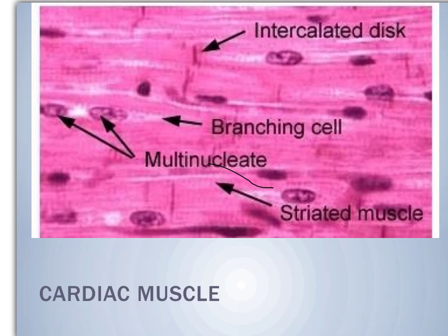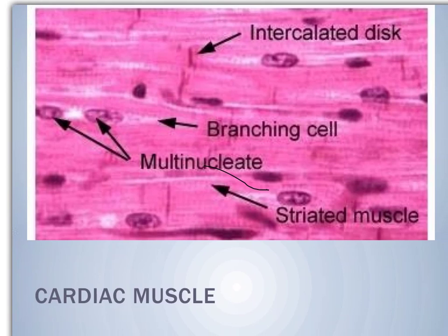This picture shows the longitudinal section in the cardiac muscle. Mention the features that help you to diagnose that it is a longitudinal section. First of all, the fibers here appear to be cylindrical, so it is a longitudinal section. Why is it cardiac muscle fiber? Because we have the nuclei here. This is the nucleus, which is oval, and it is more or less achromatic or pale with a prominent nucleolus, and it is present in the center of the segment.